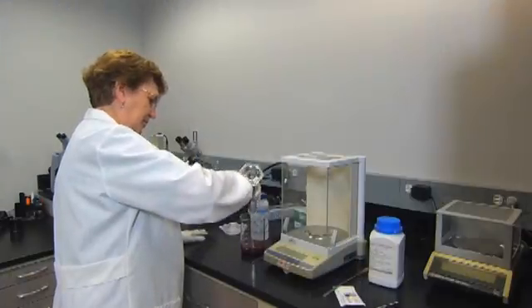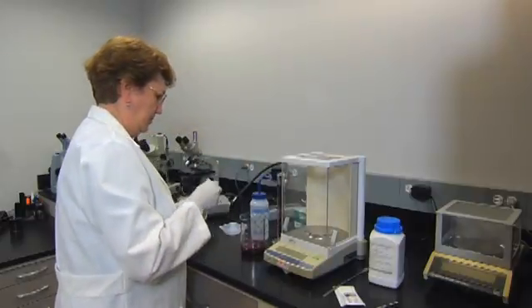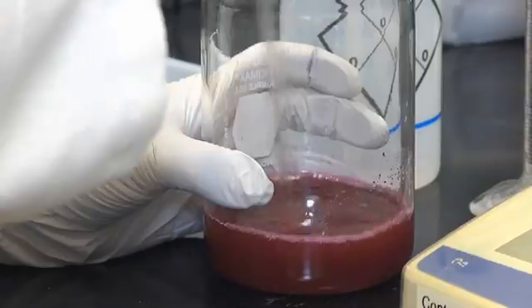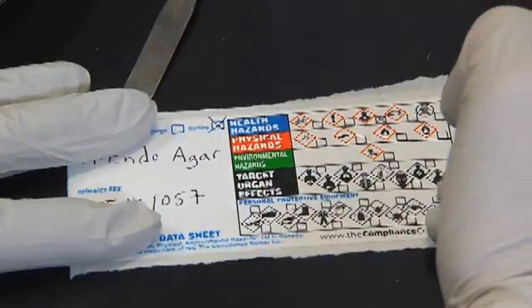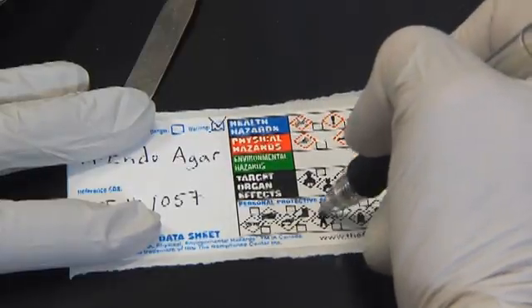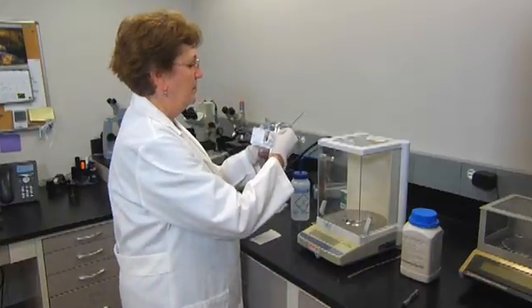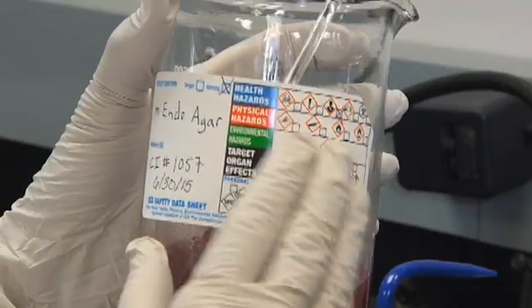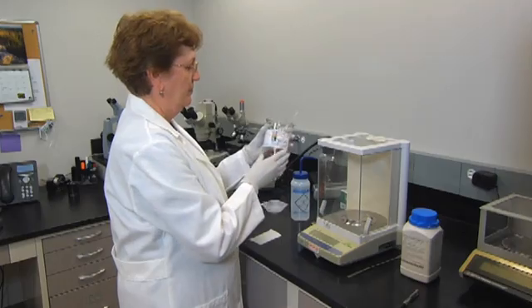A reagent is a substance that takes part in or brings about a chemical reaction. Reagents should be clearly marked with concentrations, the date they were made, and the lab worker's name who made them. This information should also be recorded in a reagent log book. It's a good idea to have the lab supervisor take part in the labeling of these products. That way, information is shared with other lab technicians.